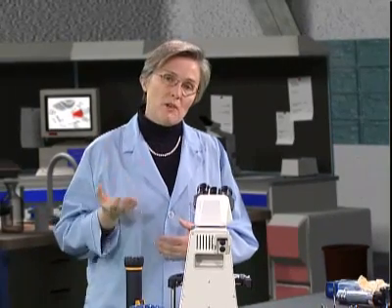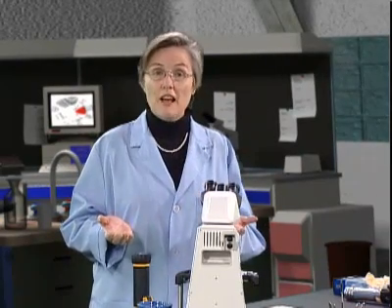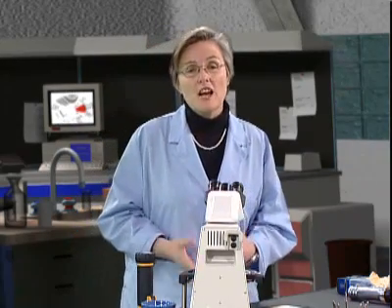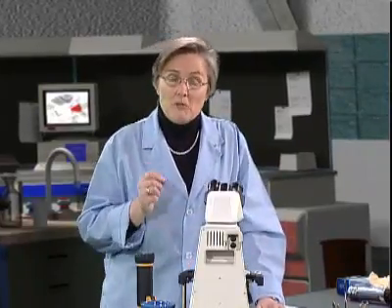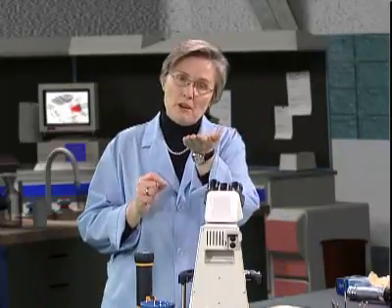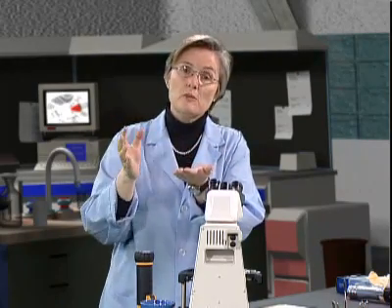Now, when we talk about the third method for visualization or enhancement of fingerprints, what we're talking about doing is causing a chemical reaction to occur and then using a physical method to develop or enhance that fingerprint. And the most commonly used combination technique is by the use of superglue or cyanoacrylate. And literally what is happening with this particular combination method is, if we have a fingerprint on a surface, we're going to expose that fingerprint on the surface to the fumes of the superglue.